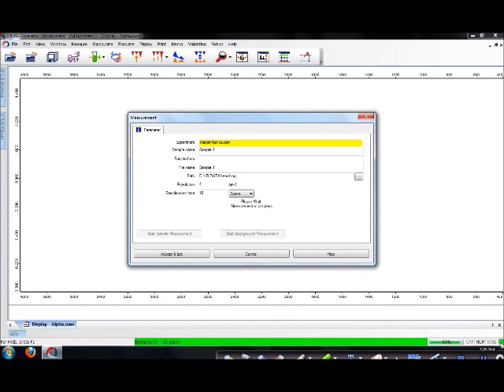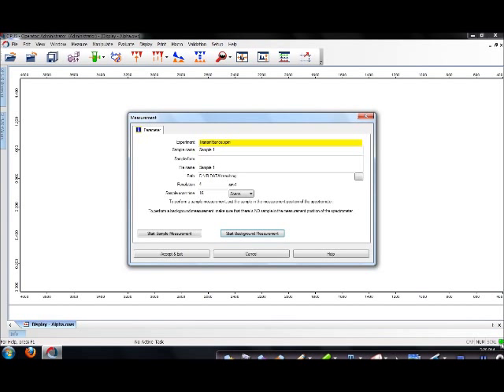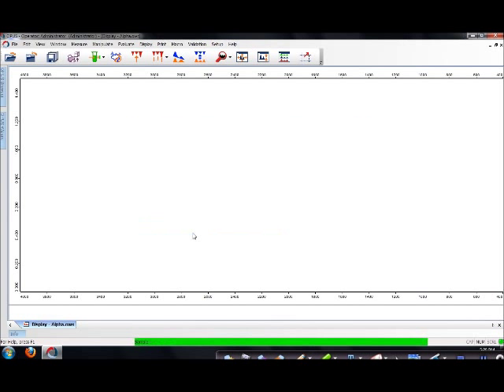Look at the green bar at the bottom. It shows how many scans you are having in the system right now. Once your background scan has been done, insert your sample into the machine. And when it's ready, click Start Sample Measurement.